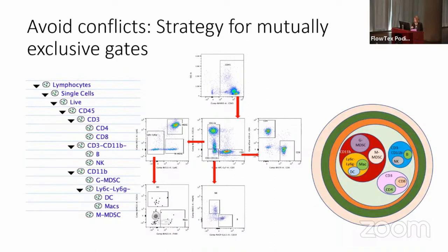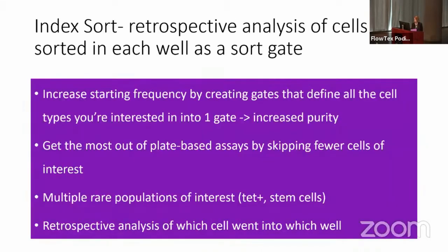So, as careful as the sort operator will be to make sure that this doesn't happen, you need to be thinking, as a researcher, about making sure that this is not included in your sort. I think I'm mostly at the end of my talk.